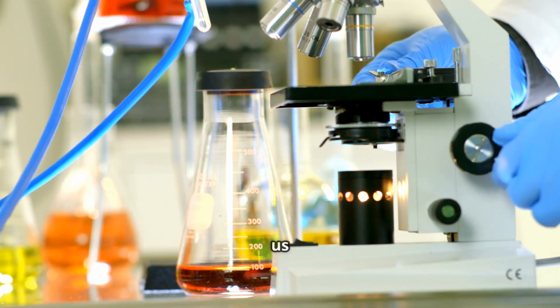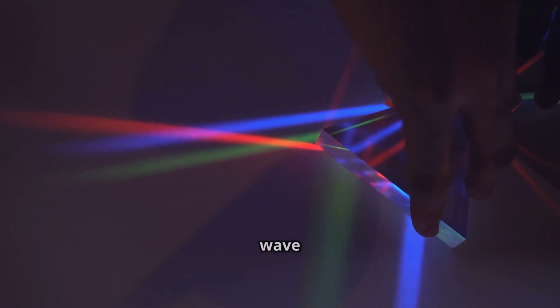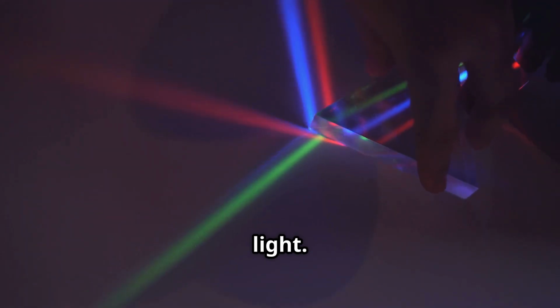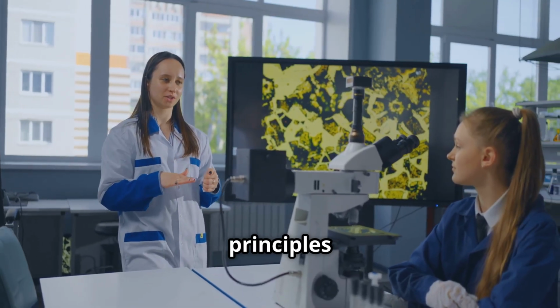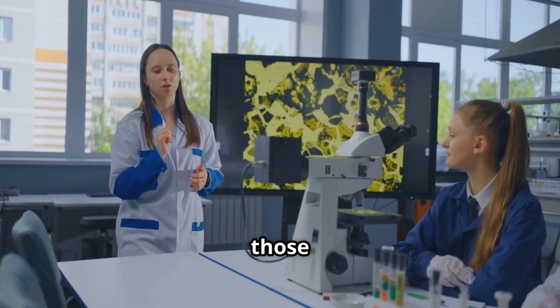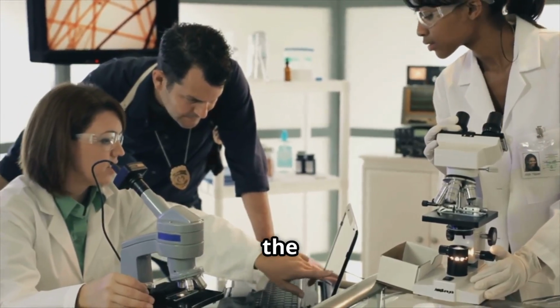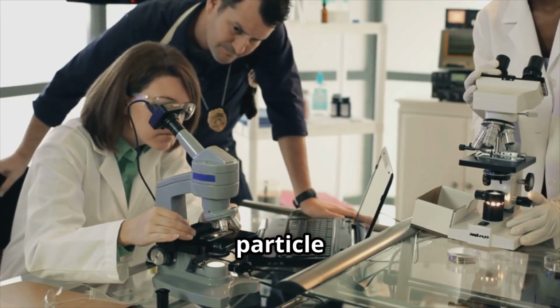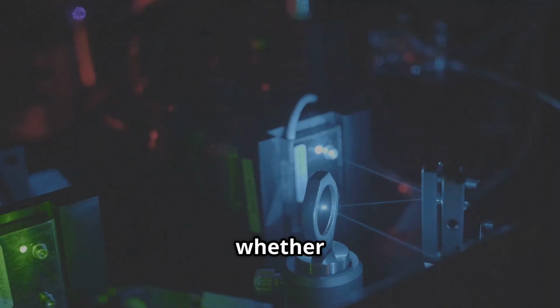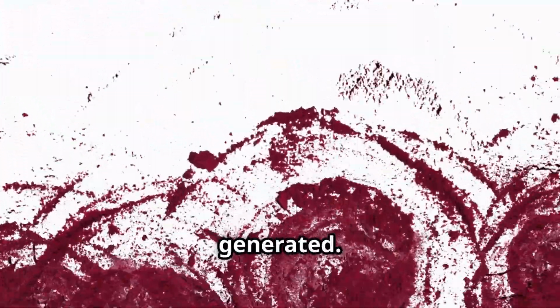Before moving on, let us revisit the physics behind how microscopes work. Let's recollect the basic principles of the wave and particle properties of visible light. Electrons also have both wave and particle-like properties, so many of the principles of electron microscopy are similar to those of light microscopy. All microscopes have limitations on the size and detail with which they can be used to visualize objects based on the characteristics of the particle being used to create the image, whether photons or electrons. The wavelength at which these particles travel has a direct impact on how much detail can be seen in the image generated.